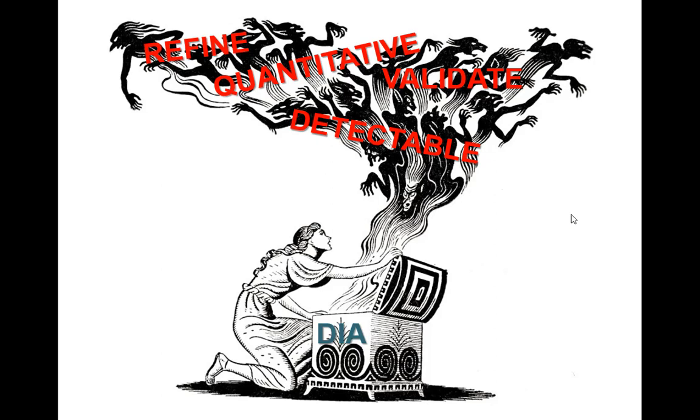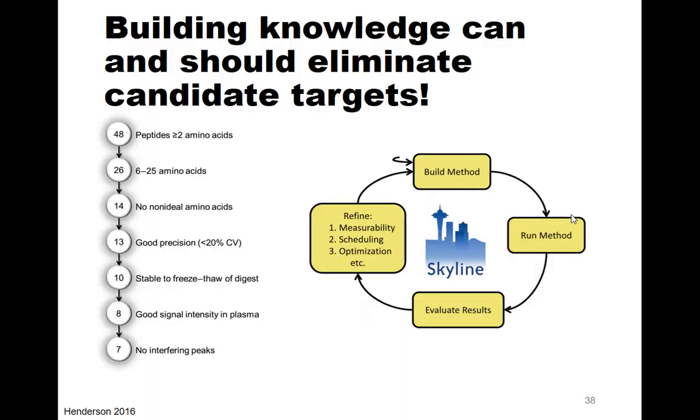So I would say, if there's a specific goal in mind for your targeted assay, targeted assays are still the best bet. Don't just resort to DIA because it's the new cool thing to do. There is still 100% a place for targeted assays.